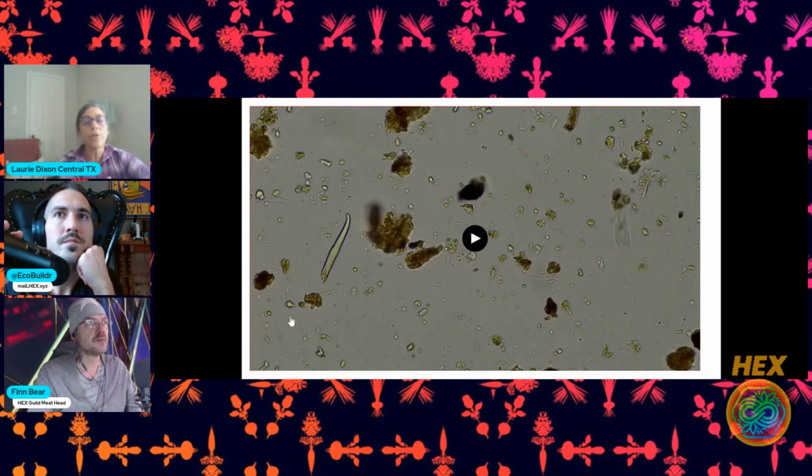You're going to see fulvic acids first, and then as you get more cycling, more biological activity, you're going to see the darker ones, which are the humic acids, which are actually food for the fungi also. And then very dark ones, in some of the samples that I have, people are using biochar. I don't think that's biochar, but biochar will look very dark black like that.